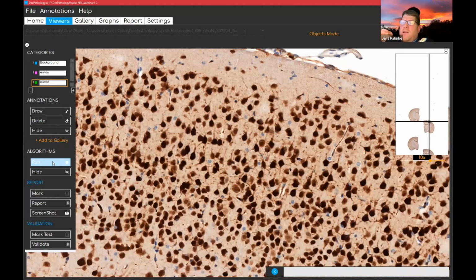And immediately it uses the information from the teaching to detect now our objects that we have segregated. So I would expect some of the darker ones will be in the dark group, some of the brighter ones will be in the bright group.